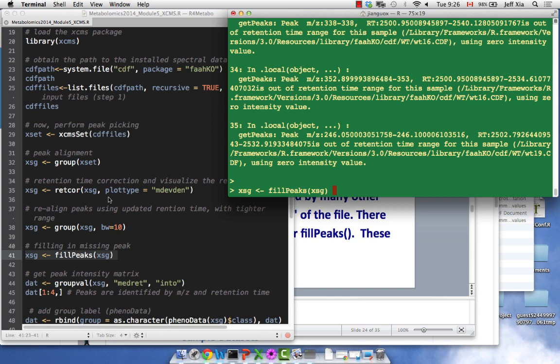What does it mean? Okay, help group. Try to use the command help. Help group. If you really want to find each exact parameter, what it means, use this command and you'll get a list of help information for what the function does and what parameters are available. Help group is a question mark, group. Yeah, selecting which you want. Just always follow this.